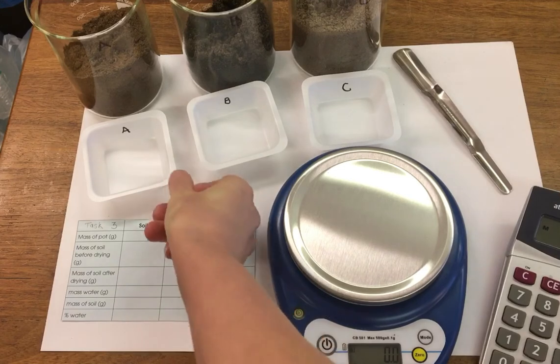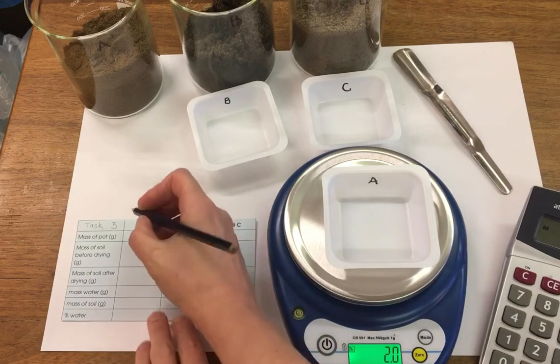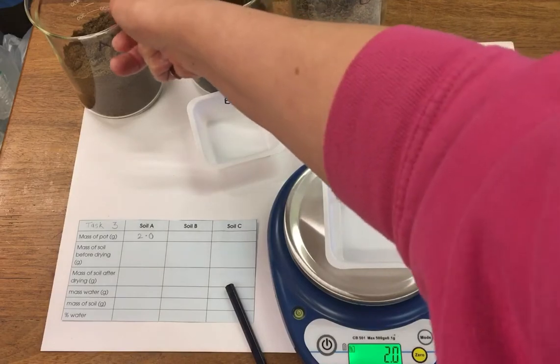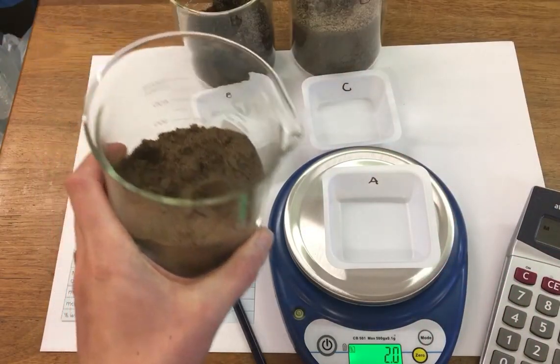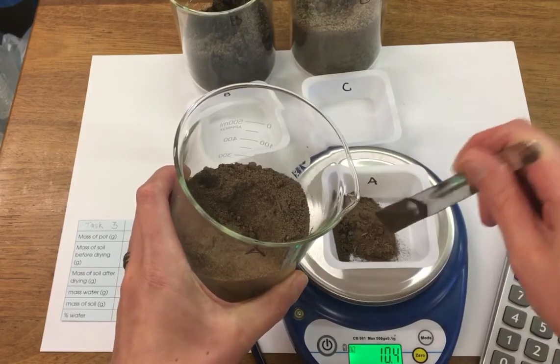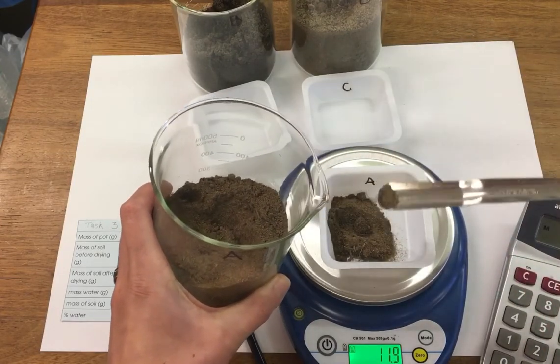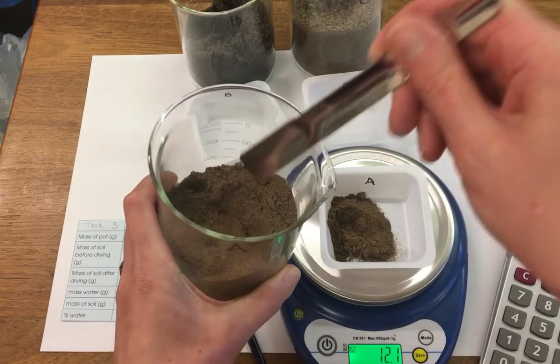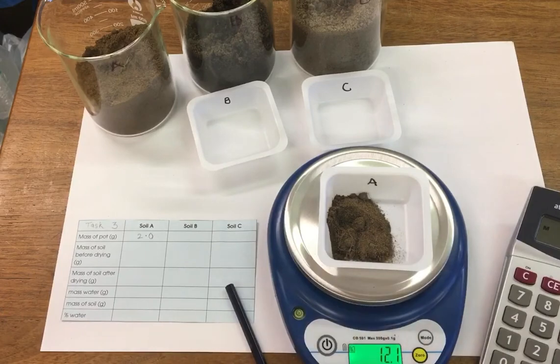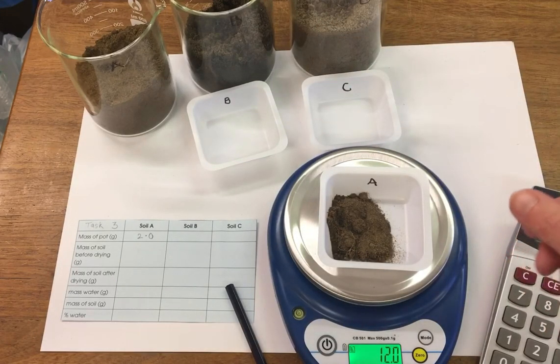First of all we need to find the mass of our containers. This one is two grams, so we're going to take a note of the mass of each pot, and then I'm going to measure out exactly 10 grams of our first soil sample, soil sample A. This one has exactly 10 grams of soil and our pot is two grams.